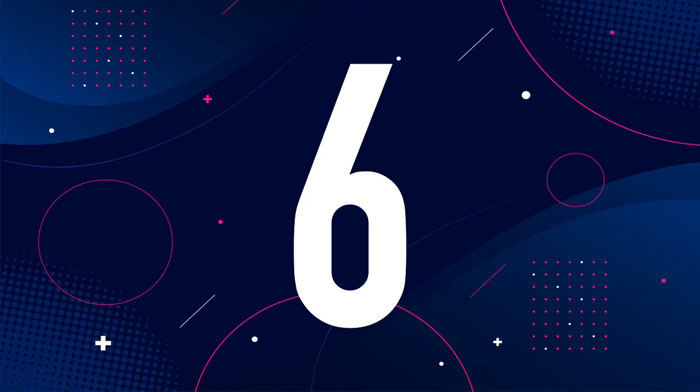The other thing is the idea of field of view. We brought this up with our letter E. When I'm at a lower magnification, I get a bigger field of view. This is the other thing that's nice. When I'm at the 4 and the 10x, that's the time to scan around and make sure I have a good view. Even though I can't see the cells, I can tell if my dye is too clumped or too thick. That's why a lot of times when I walk around the room, I'll move you to an area where it's a little thinner so you can actually see the cells.